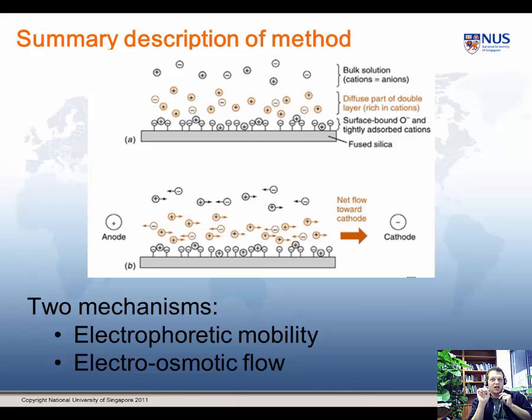Anything that you apply a potential to is a driven cell, and in those cells the anode has a positive charge and the cathode a negative charge. You'll remember with thermodynamic spontaneous galvanic cells from your electrochemical studies that in those situations the anode has a negative charge and the cathode a positive charge.